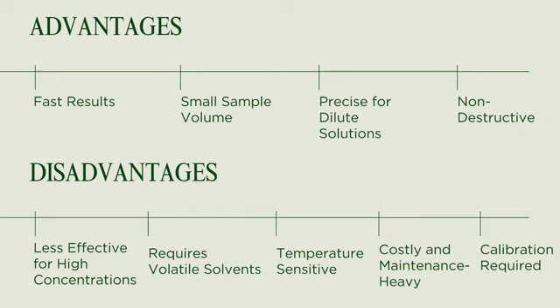The disadvantages are, this method becomes less sensitive when the solution concentration is too high, as the vapor pressure difference between the solvent and solution can become negligible. It is best suited only for volatile solvents and may not be applicable for solutions where the solvent doesn't vaporize easily, such as highly viscous or nonvolatile solvents.